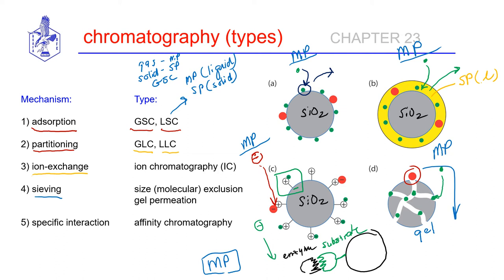Okay, so I can separate very specific molecules, and once again, this is done a lot with biochemistry and molecular biology. So, basis on specific chemistry, this is called affinity chromatography. So, these chromatographic methods are robust. They're designed for basically any kind of sample we can think of, and they are very effective.